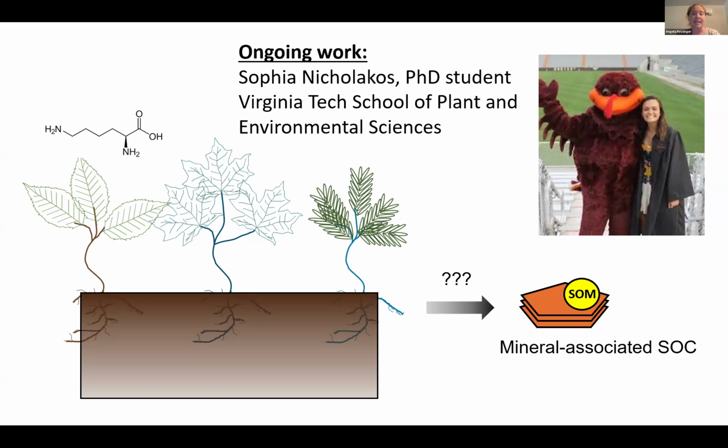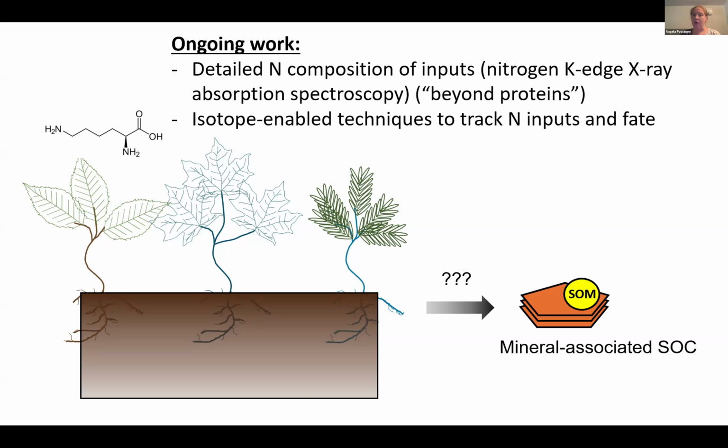What we're looking at, more specifically than just a broad nitrogen composition, is the specific gradients in the composition of things like cytokinins, which are nitrogen rich, but a little bit less oxidized than a lot of amino acids, for example. So what the microscale imaging work allowed us to do was broaden our scope of potential target compounds and potential measurements of relevance for composition of nitrogen assessment.